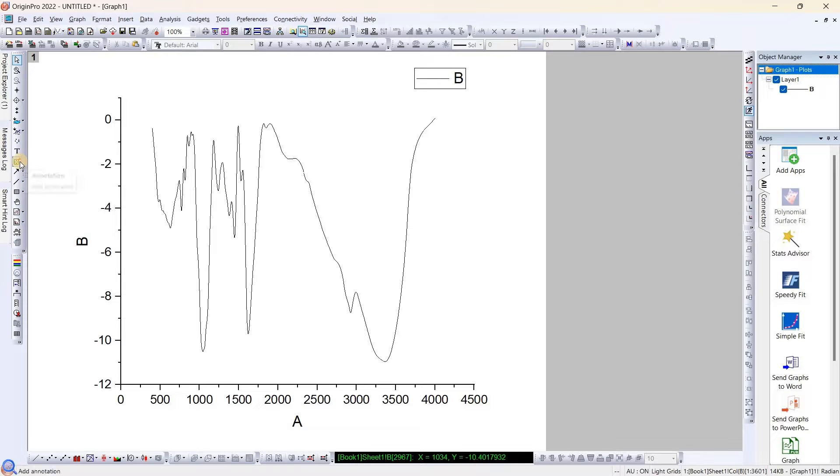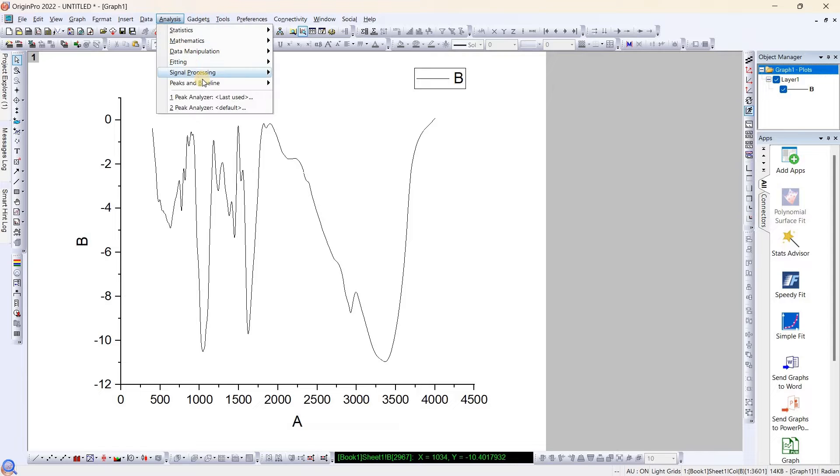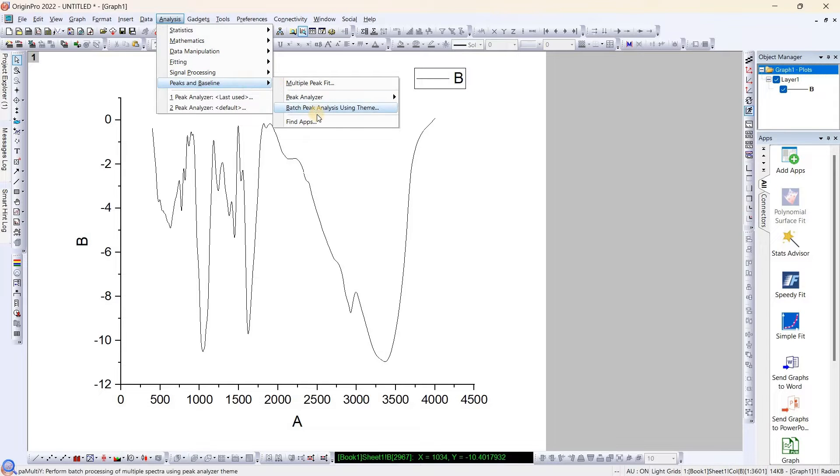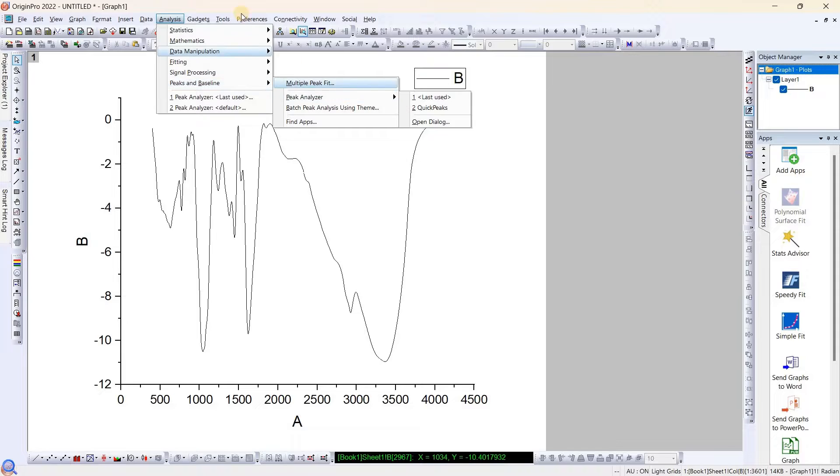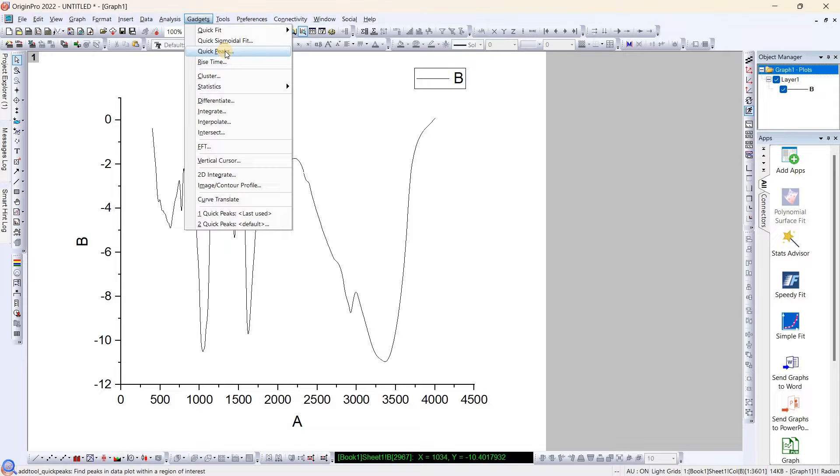First one is the annotation method where you can find manually in your graph. Second method is going to Analysis, Peak and Baseline. And third method, which I prefer to find the peak, is the Quick Peaks. Based on your convenience and kind of graph, you can choose any of these methods.